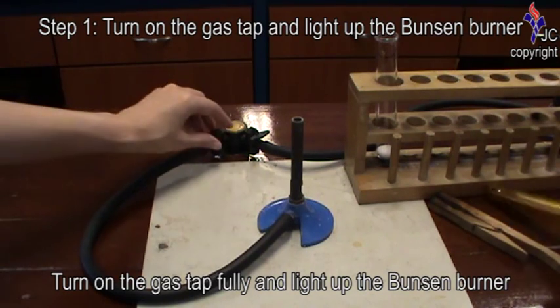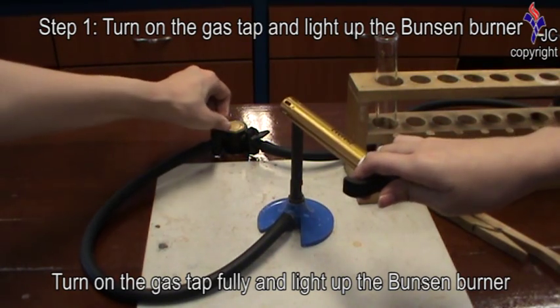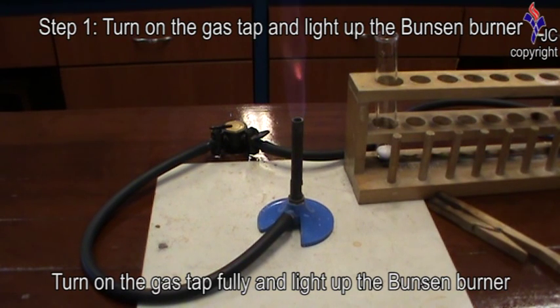Turn on the gas tab fully and light up the Bunsen burner by placing the tip of the lighter perpendicularly to the barrel of the Bunsen burner.